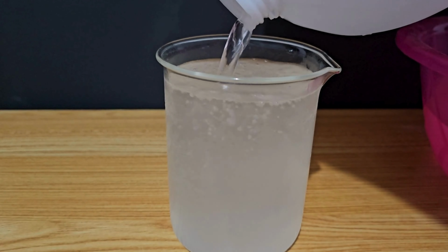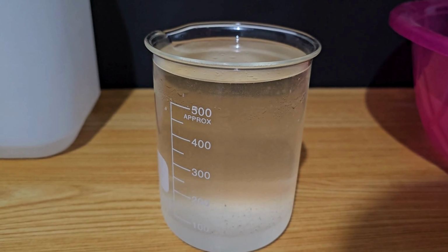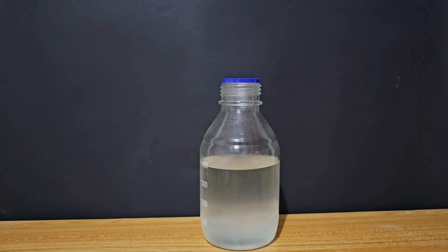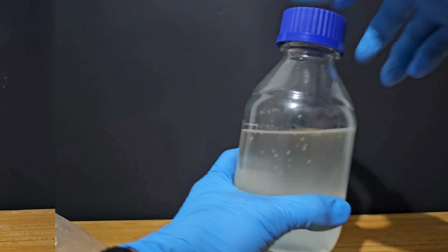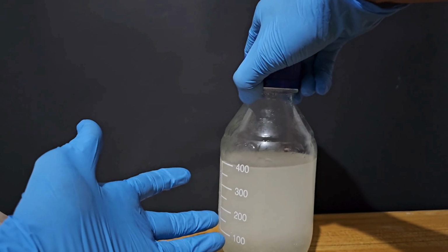I mixed both remnants. I put them in this bottle and added some scoops of table salt. I mixed the bottle well to separate as much chloroform as possible.